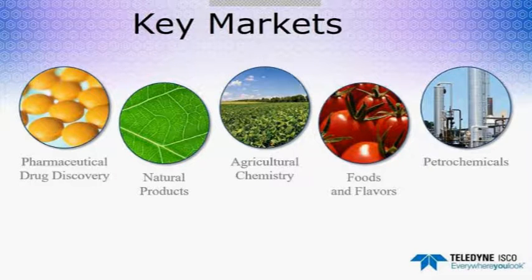Let's see, how do you develop alumina-based separations? I find the TLC plates to be very unpredictable of column separation. Should we oven dry our plates? I find that TLC plates are actually pretty good. What I also find is that there's some certain ways of running TLC plates that improve reproducibility.